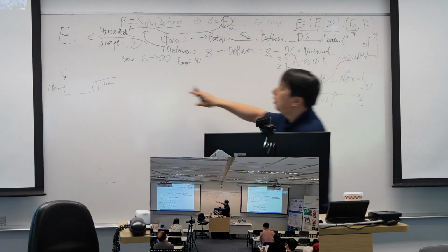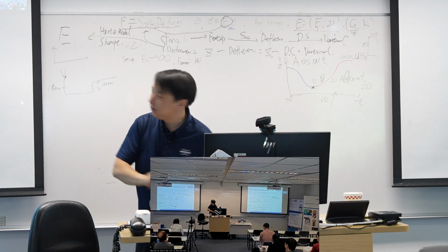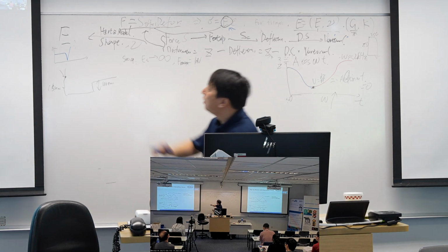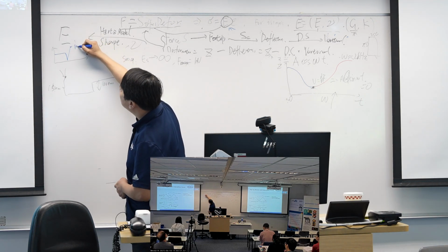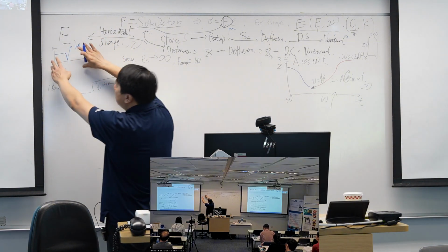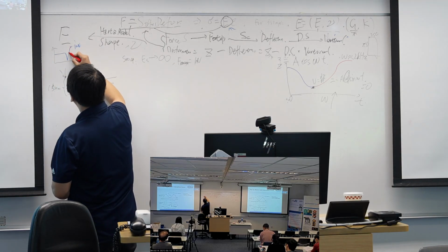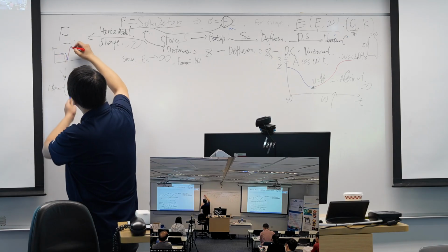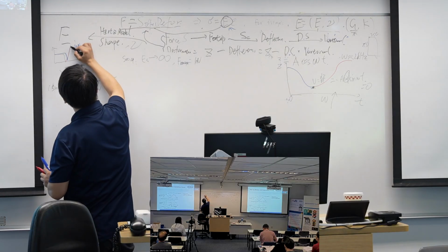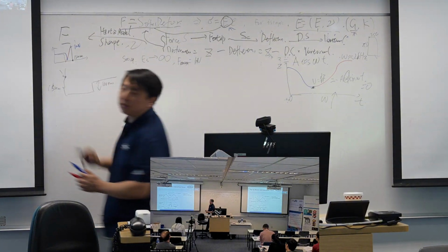On each point, I would do a force curve like this, and the maximum force is 1 nanonewton. The distance my probe will travel is 150 nanometers.